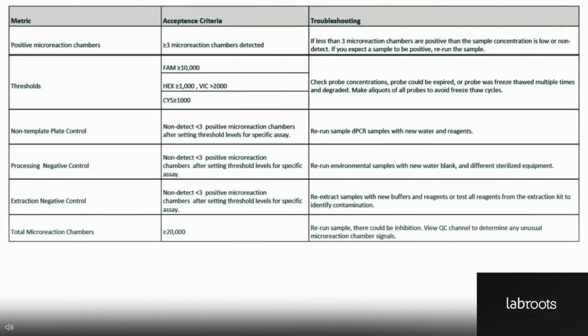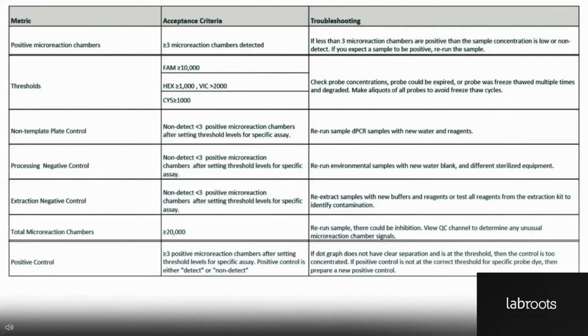We expect to see the total number of reaction chambers in one well is greater than 20,000, and we expect to see the positive control shows greater than 3 positive microreaction chambers.